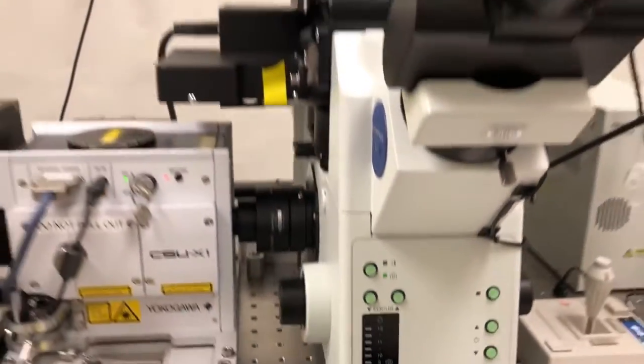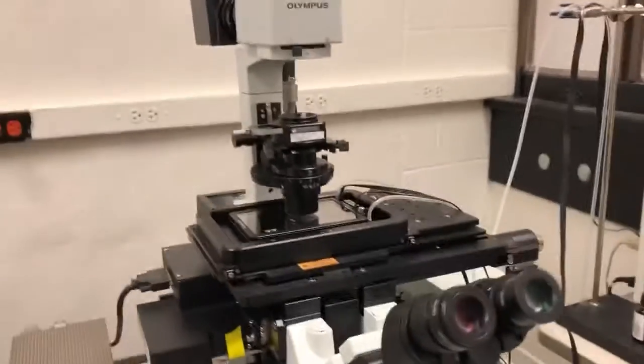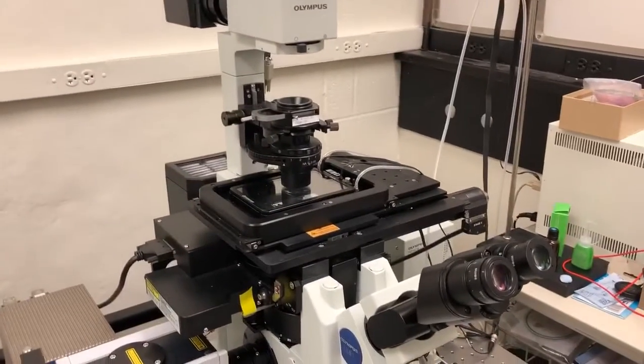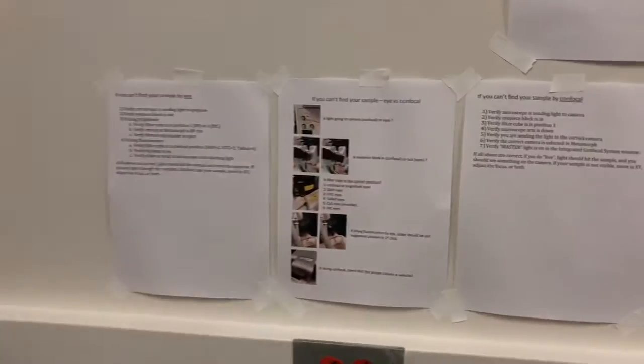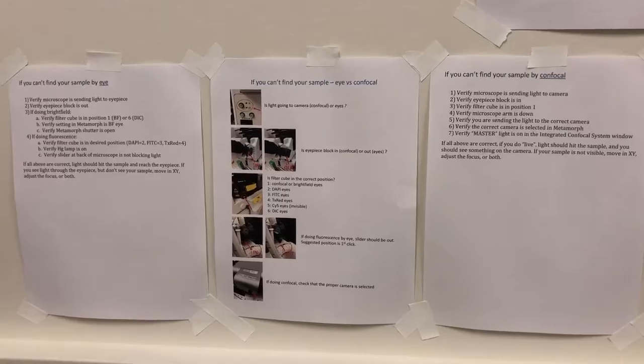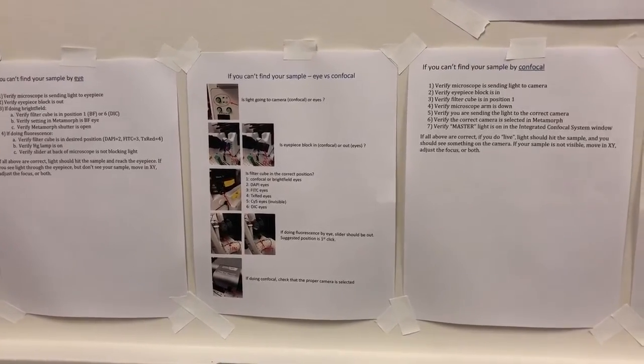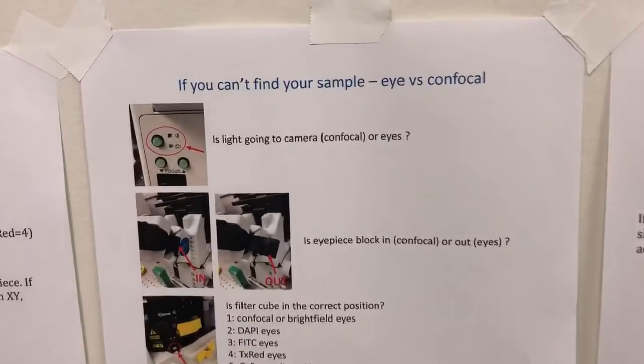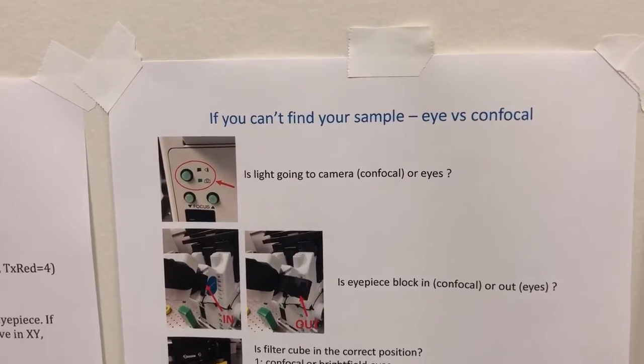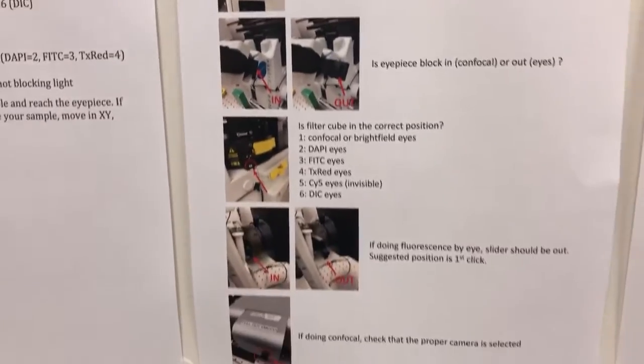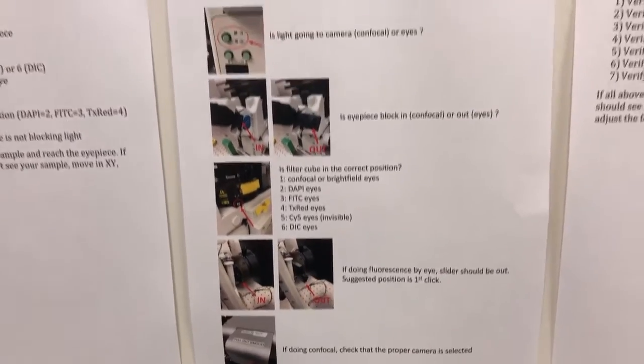Now, if you are trying to look at things by eye, or you are trying to look at things with the confocal and you can't see anything, we have a number of instructions here on the wall that will help you troubleshoot this. If you can't find your sample, here are some things that should be different between the eye and the confocal. You can read those there if you're ever in that situation.